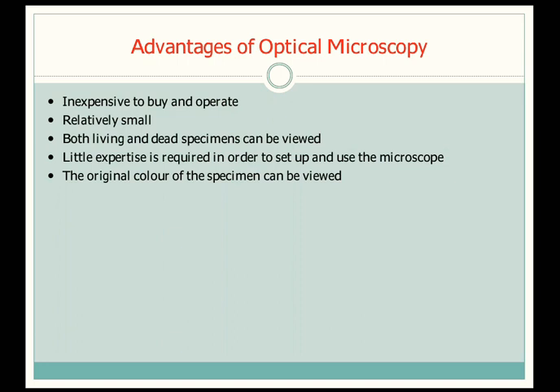The original color of the specimen can be viewed. It will not show us an image with different colors. It will show the exact color of the image, but in an enlarged form.